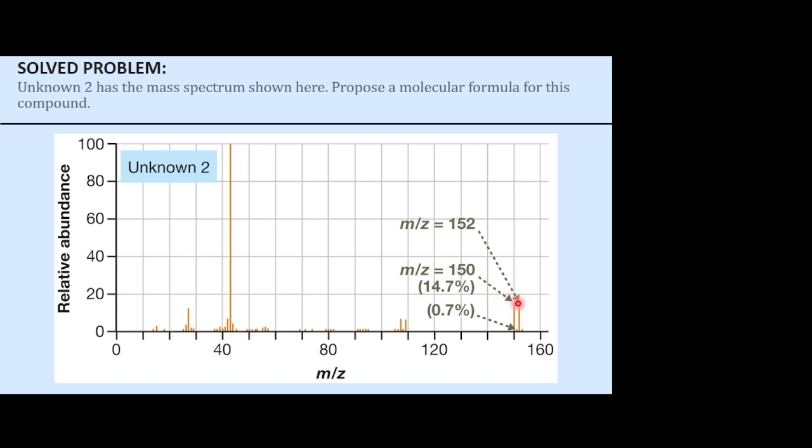See, this double peak is because of a bromide or chloride? The double peak goes away when the halogen goes away? Exactly. Because that's due to the +2 isotope, isn't it? Yeah. So you would need to see that go away for that to be the mass of your isotope. Now, this is a bit more complex and a bit more difficult to use.